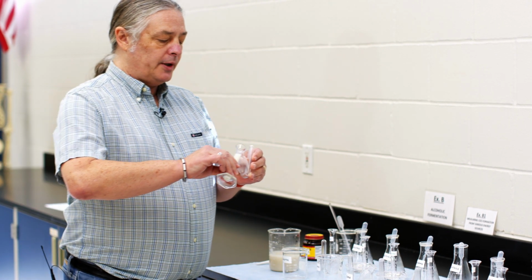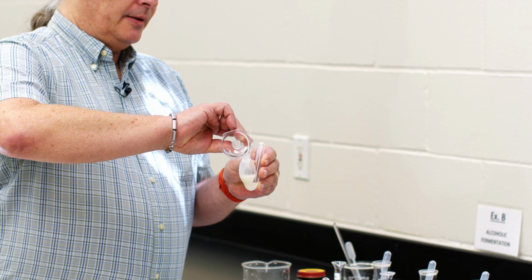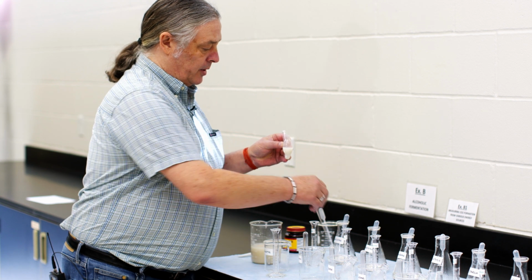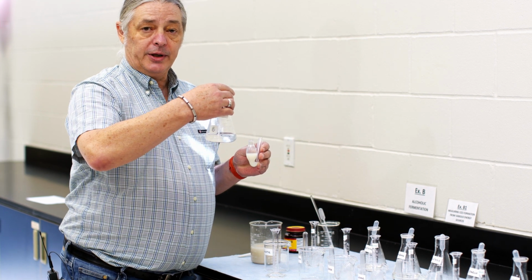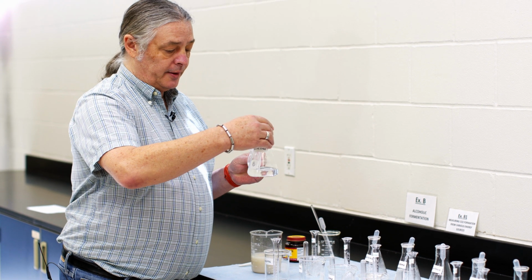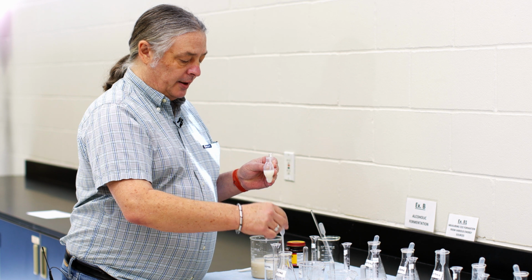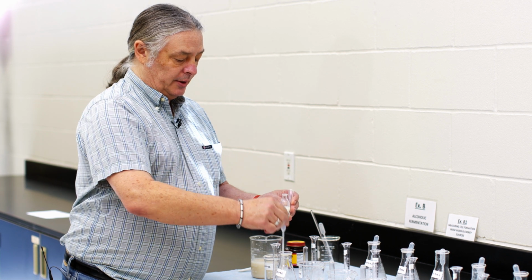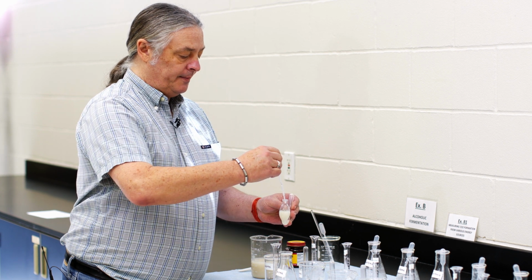We're going to load each one of these tubes with the portion of yeast, like so. Then we're going to give them a potential energy-rich molecule to work with, in this case, glucose here. And again, we're going to use another 10 milliliters of this solution added to the yeast to give them something to potentially work with.